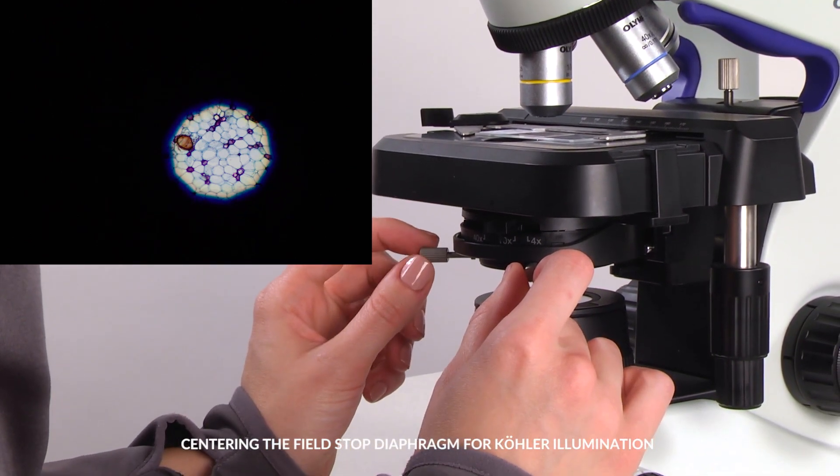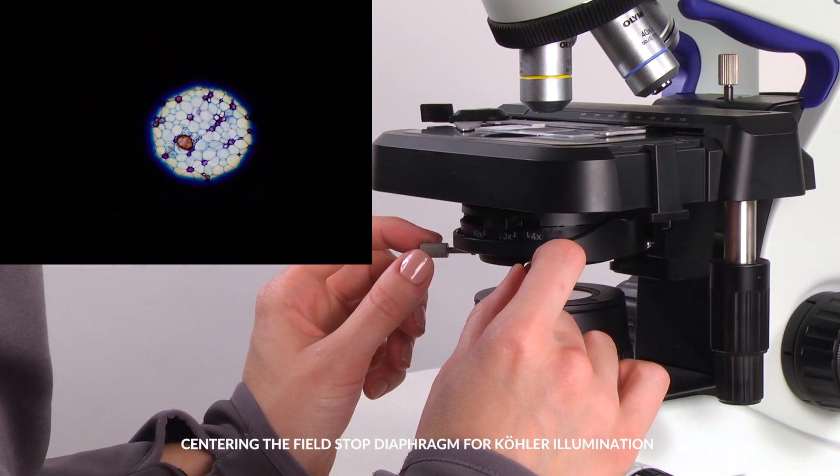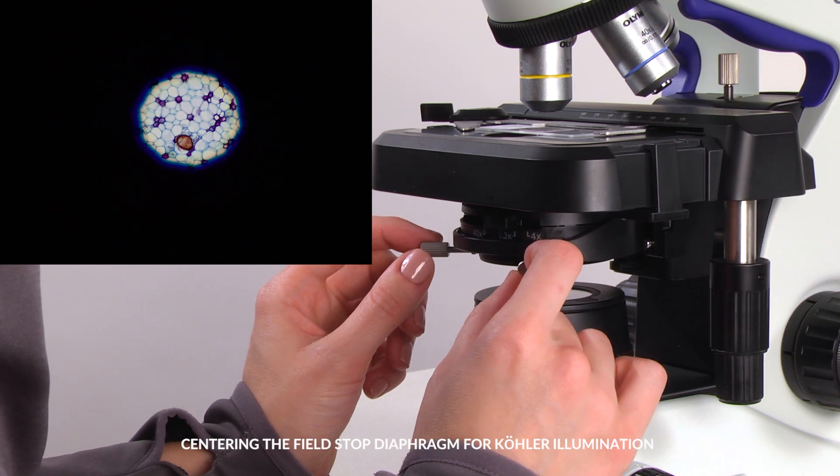Bring the field diaphragm image to the center of the field of view by rotating the auxiliary lens centering knobs.